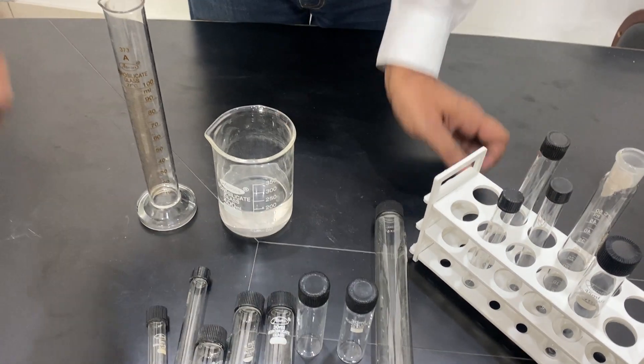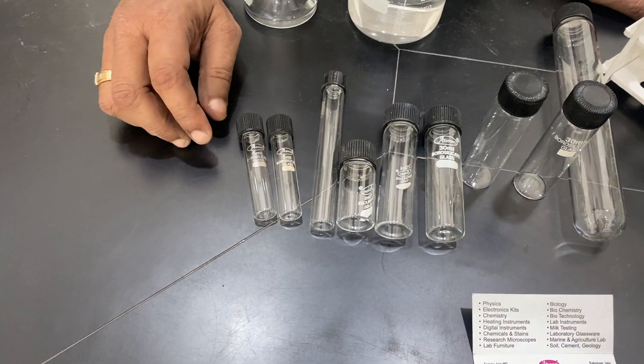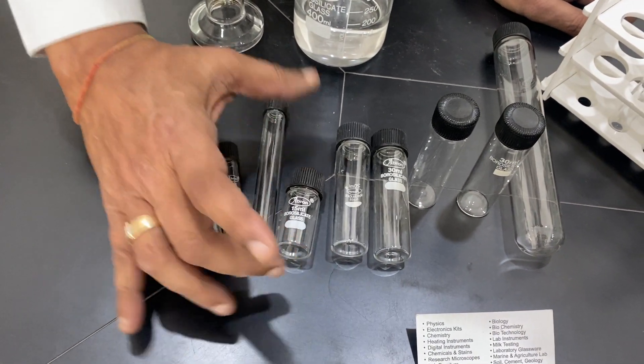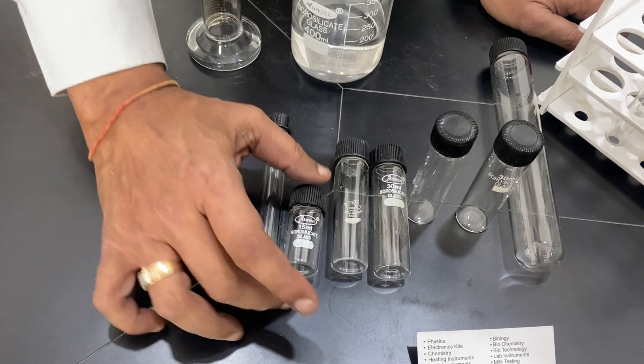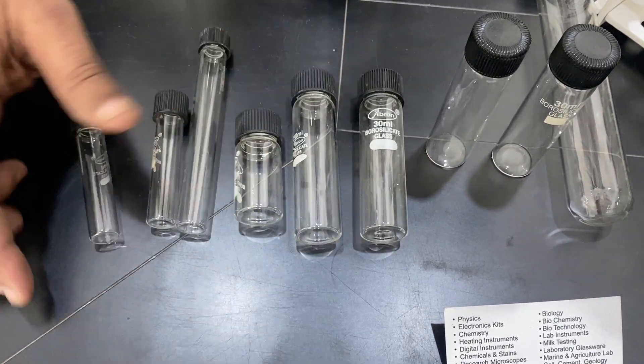They come with a flat bottom also, available in 2 ml, 5 ml, 10 ml, 15 ml, and 12 ml. This comes in two sizes: tall form and short form. These are 15 ml short form, and then 20 ml, 30 ml, and 50 ml.